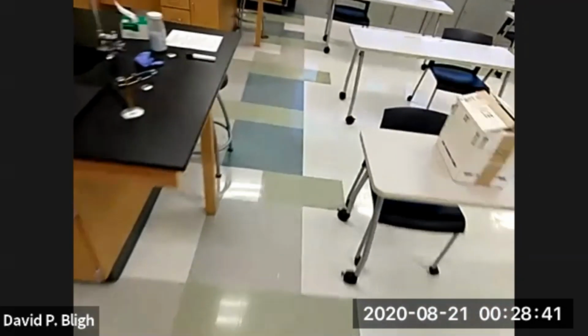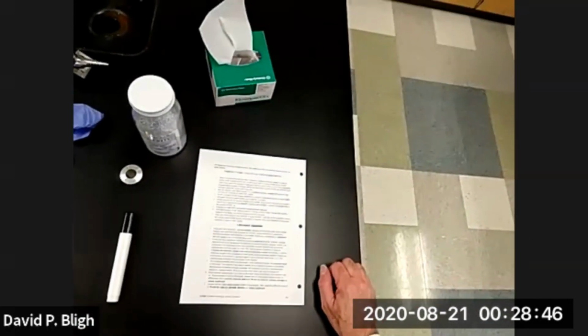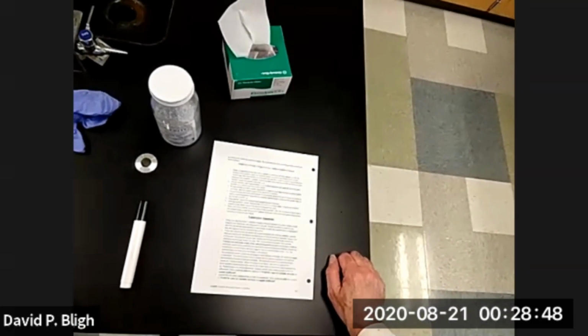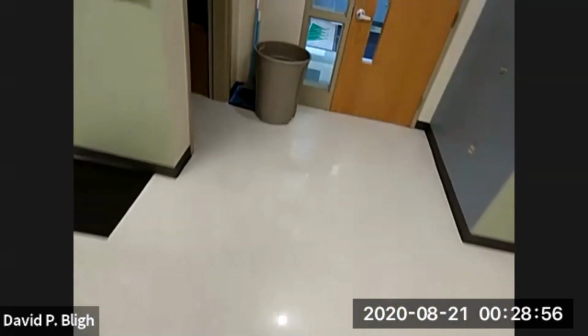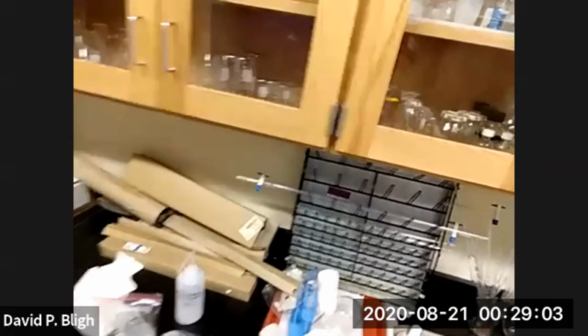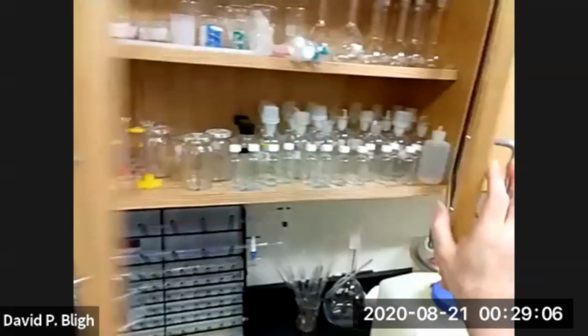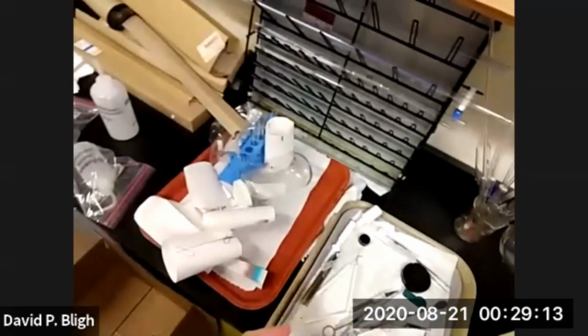Okay, let's do that. First of all, what kind of beaker do I need to run the Fizz test? Uh, 100 milliliter beaker and 30 milliliters of water. Let's see. I think we can get by with a smaller beaker. I do believe we need something to stir it with.